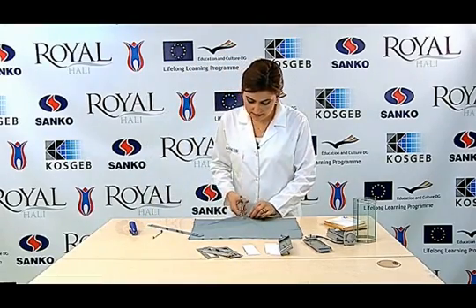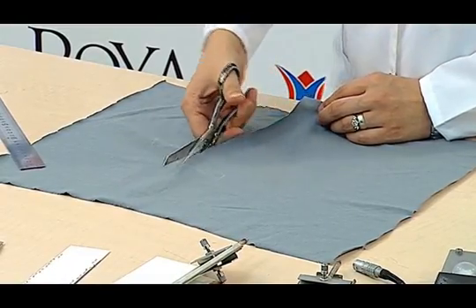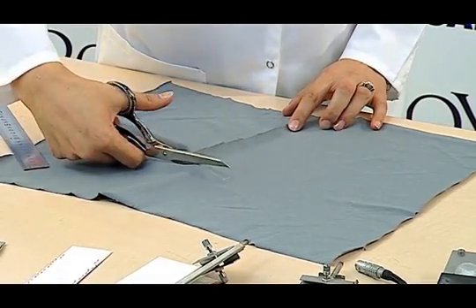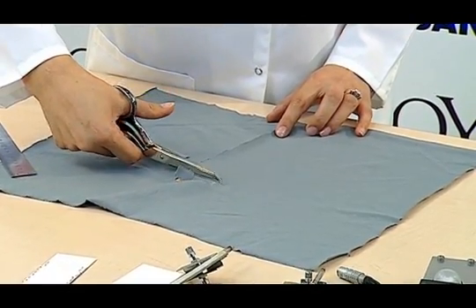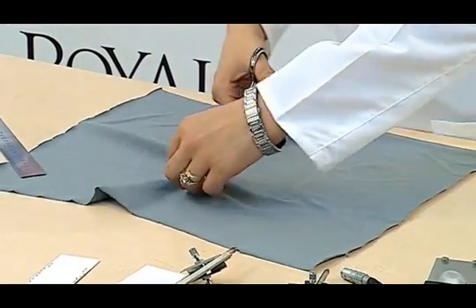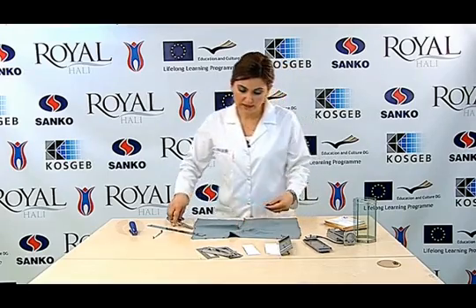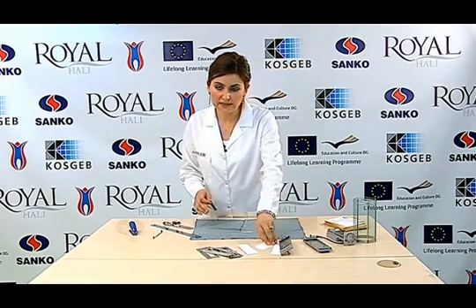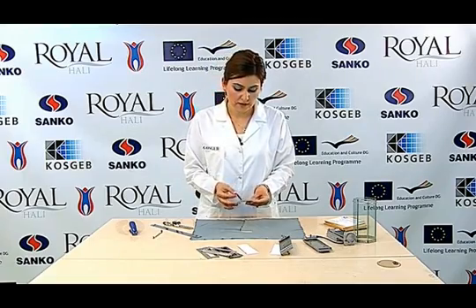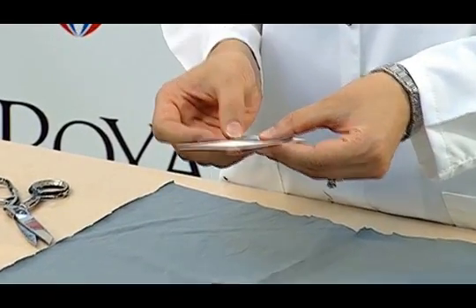If our sample is made of yarn, it is rolled out horizontally on an opaque cardboard. If the material is fiber, it is rolled in a bundle form and punched to the opaque cardboard. If the material is printed fabric, the samples are taken from each of the different colors. In this method, more than one sample are tested together.